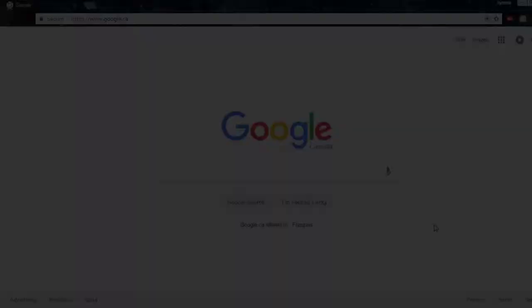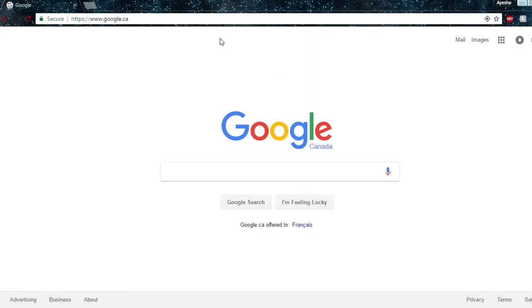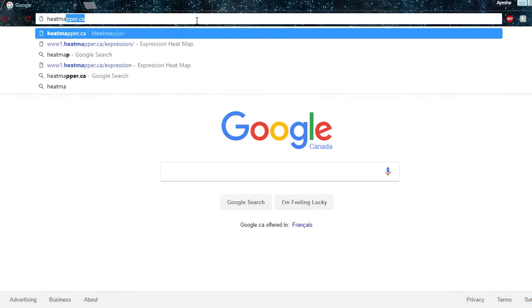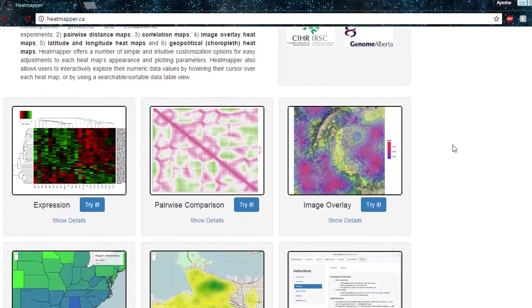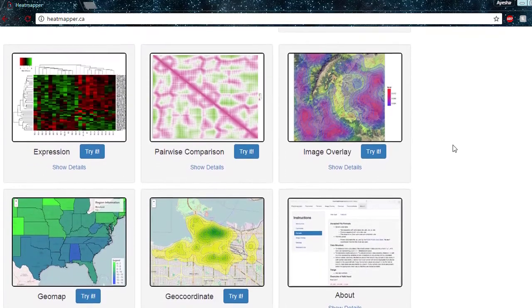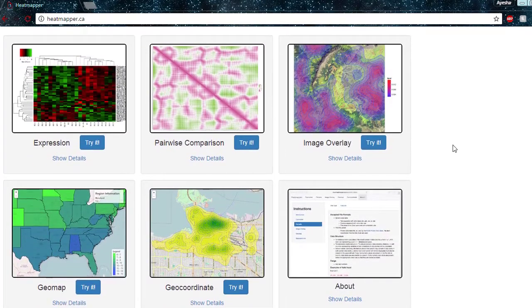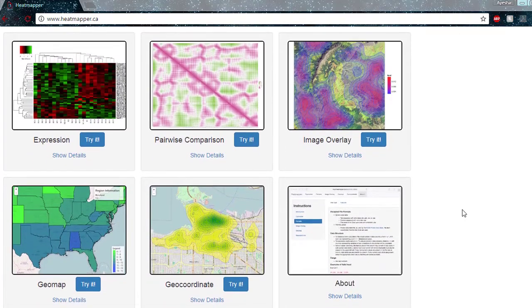To navigate to the Heatmapper interface, open up your favorite browser and type in heatmapper.ca. This will take you to the Heatmapper homepage, where all of the different types of heatmaps can be found. Let's look at the image overlay interface specifically.